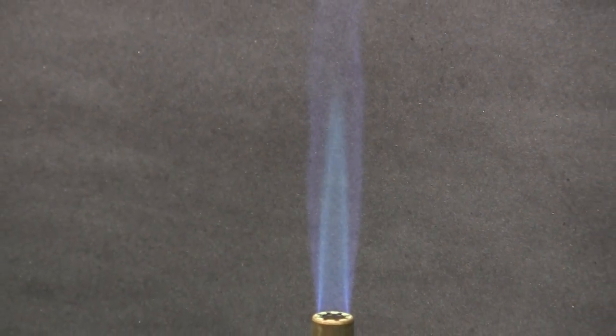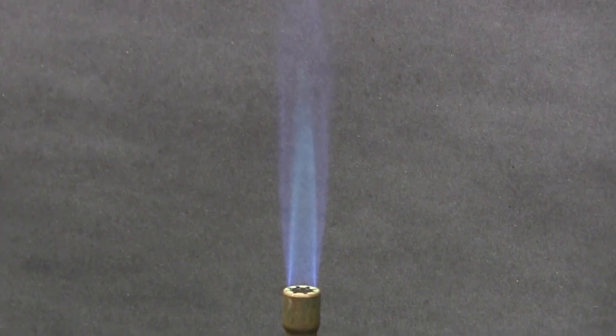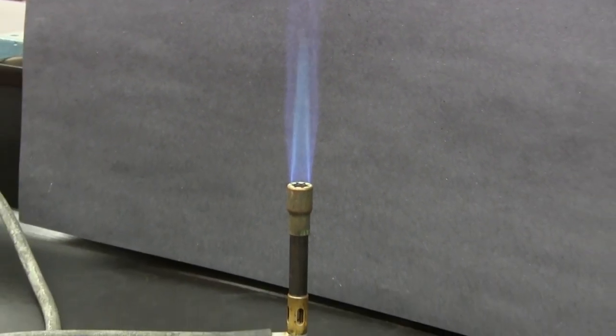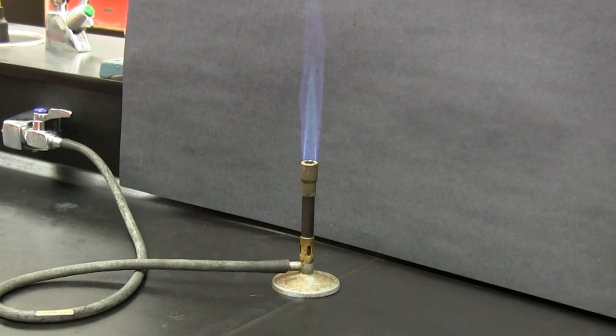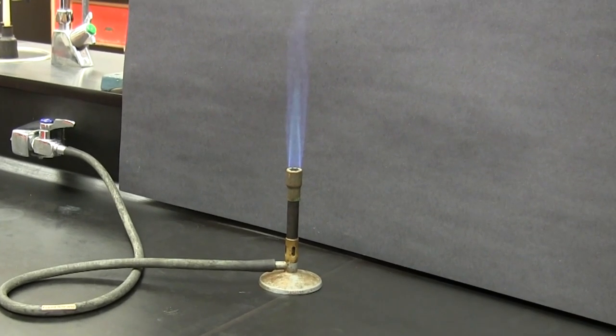So we shouldn't let the inner cone come in contact with any items we are heating because it's cold. The best practice is always to place the item being heated just outside the extreme tip of the blue cone, since this is the hottest part of the flame.